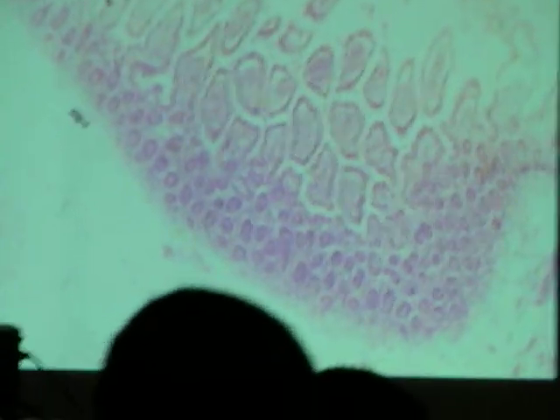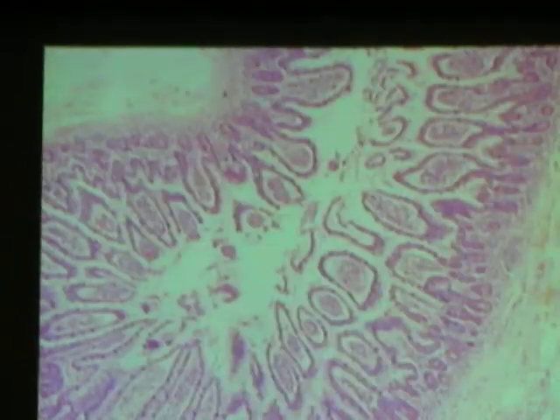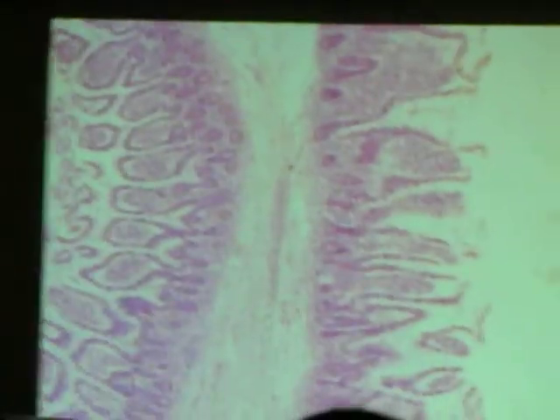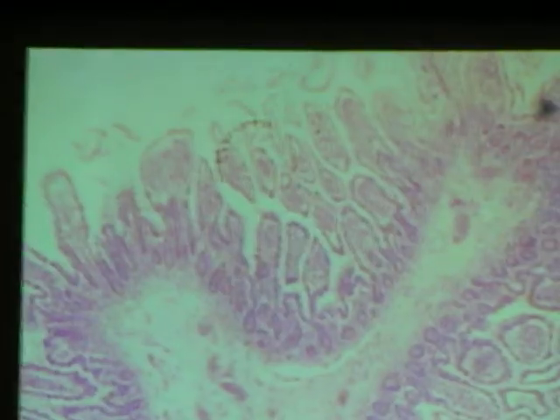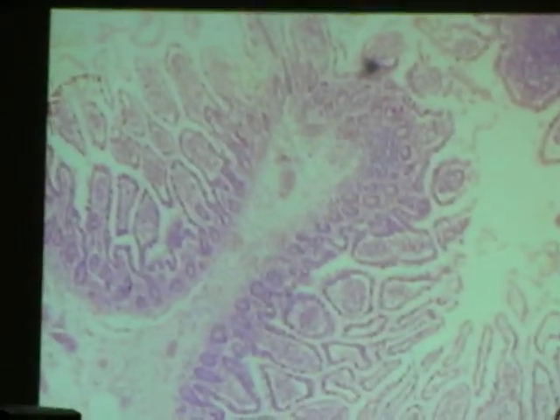Okay, so if you go through the ileum here, remember this one has the villi. Move your way around, you can see rounded projections. You may or may not think it looks like an opening.